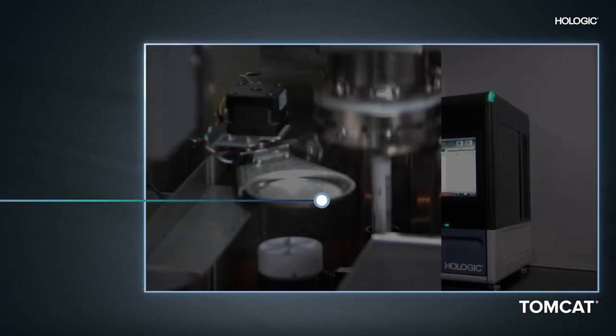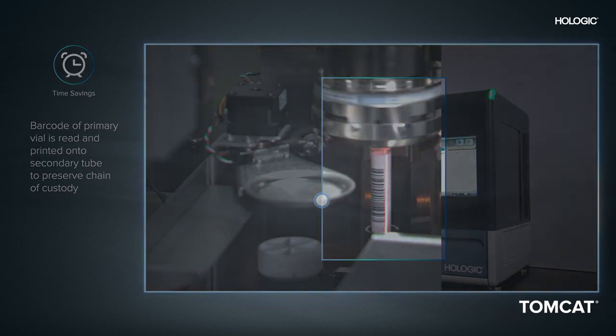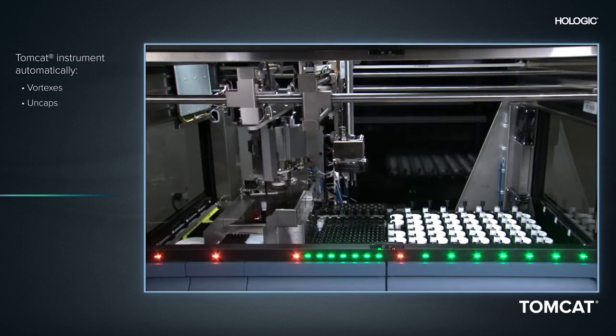Once onboard the system, the barcode of the primary vial is read and automatically printed on the secondary tube to preserve chain of custody. The Tomcat instrument's sophisticated robotics then vortexes and uncaps both the sample vial and secondary tube.